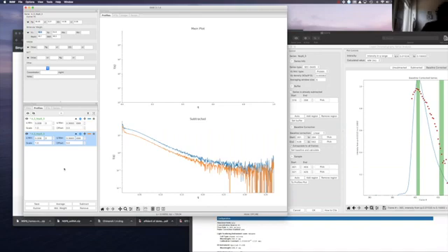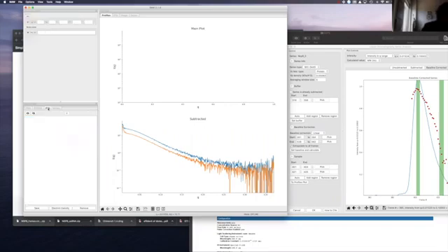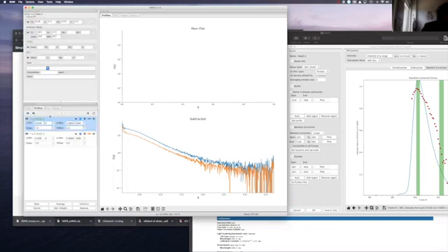And now what we can do, and I will do it in a very fast way, let's just take the hopefully most monomeric state, that's the orange one. Let's calculate the P(r) function and compare those. What's really changed? How is this monomer-dimer mixture versus more monomer? How does the P(r) function change? That was already shown by Steve, and I'm not going to repeat this presentation.